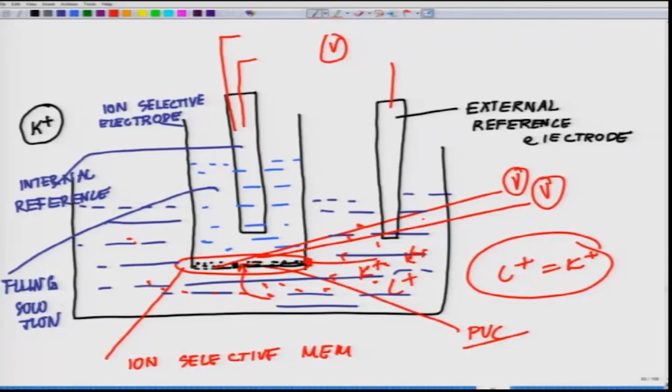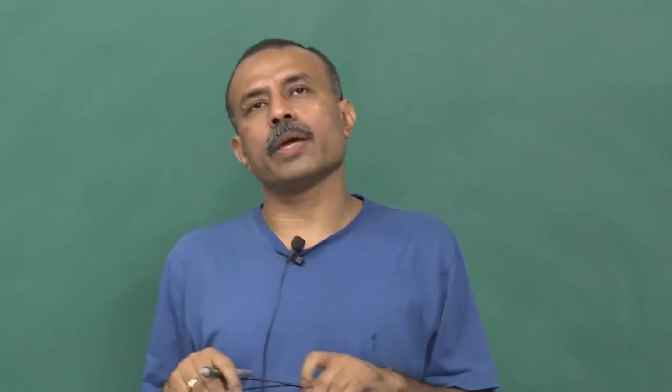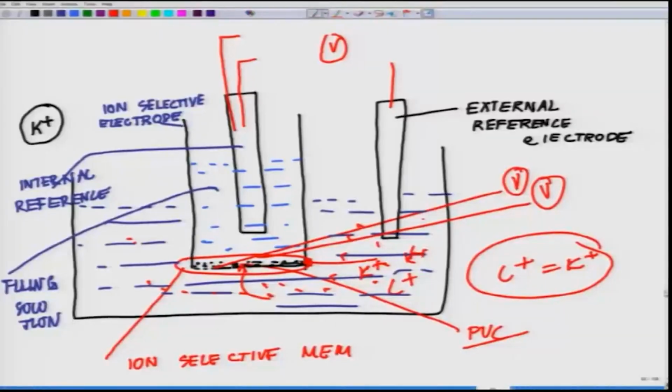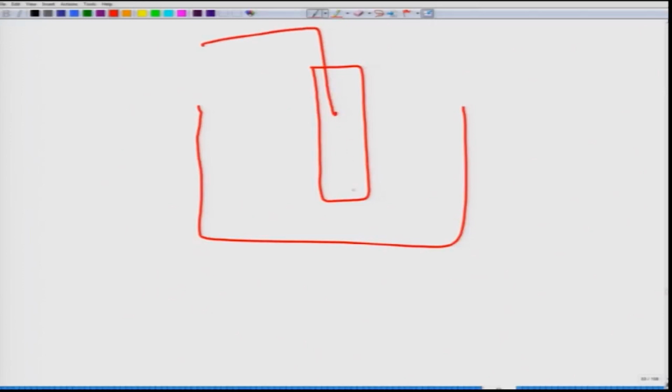So, if you remember, I told you there is no redox reaction as per se taking place here. There is absolutely no redox reaction, but this is happening in a slightly different way. If you think of it logically, here you have a beaker where you place your analyte, here you have a reference electrode along with your indicator electrode with respect to its reference. You have an external reference and an internal reference, multiple references there. Now, you have a membrane out here. Across the electrode and outside, there is a potential which is maintained, delta E.